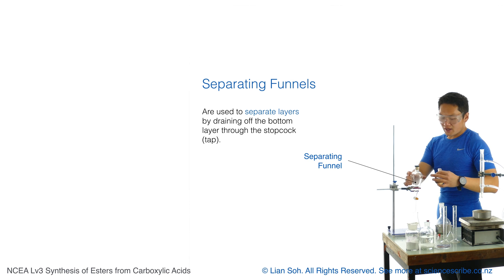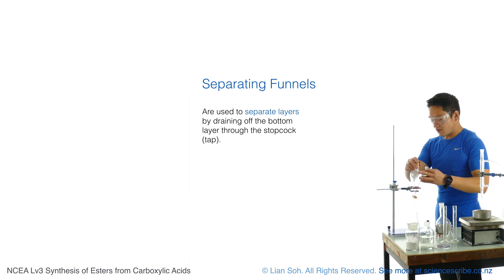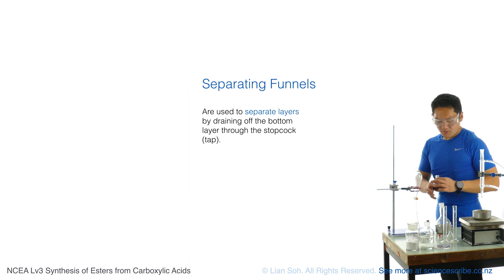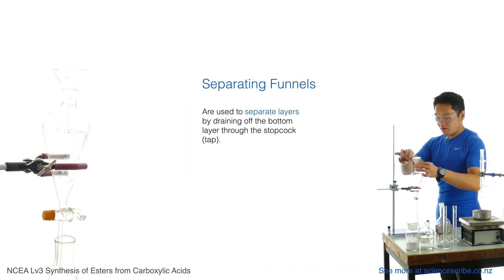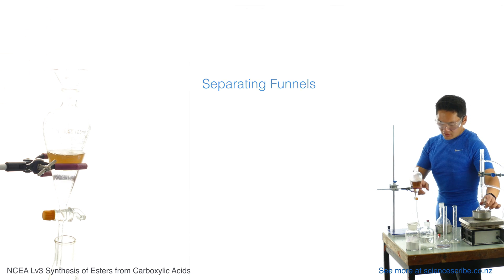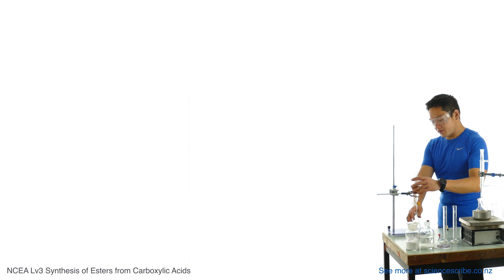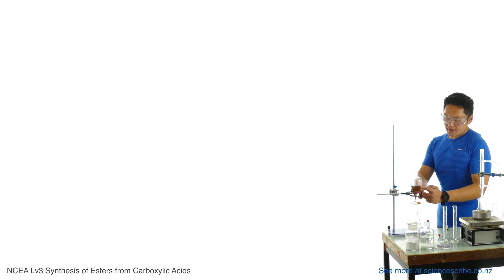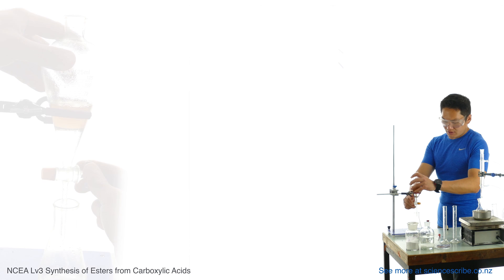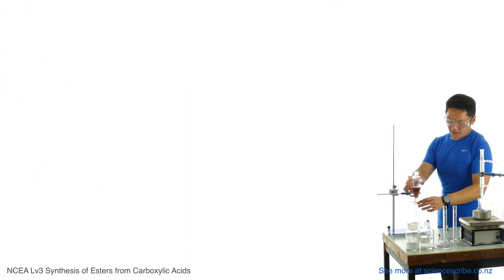We're going to separate the layers, and to do that I can use this device called a separating funnel. All I have to do is remove the cork at the top and fill it up with all of the contents from this flask. A separating funnel does exactly what it says — it separates things. In this case it separates one layer from another. My ester is on top because it's less dense than water, so I just need to open this tap and drain off the bottom layer.